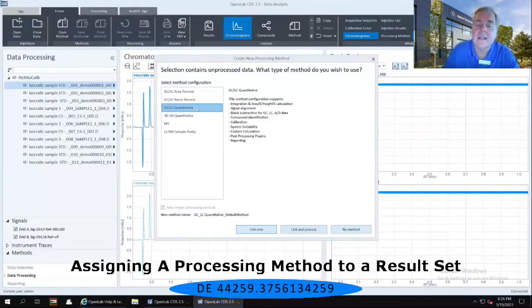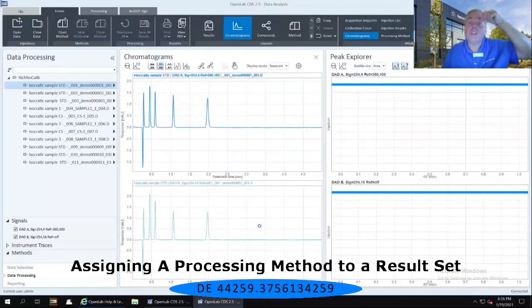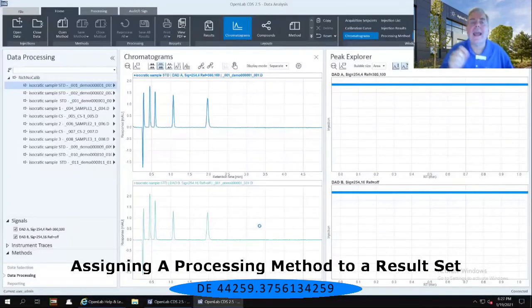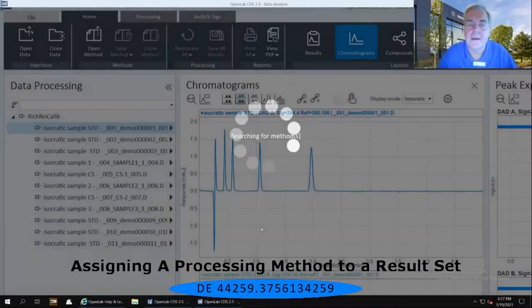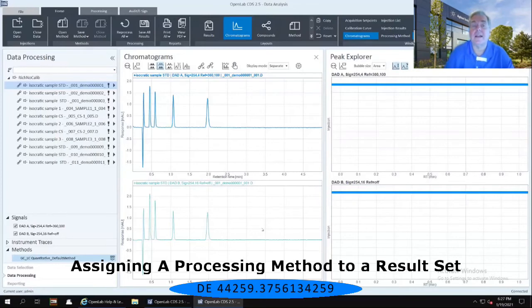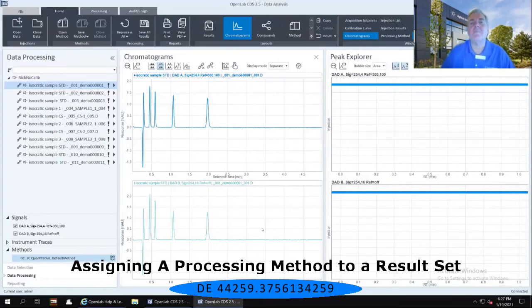I want you to select the link only, because I want to show you that when you link a processing method to a set of data and you do not reprocess that set of data, notice that the chromatograms themselves have no integrated results. So you haven't done any type of data analysis.